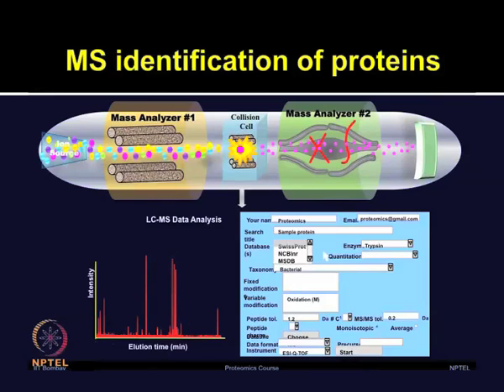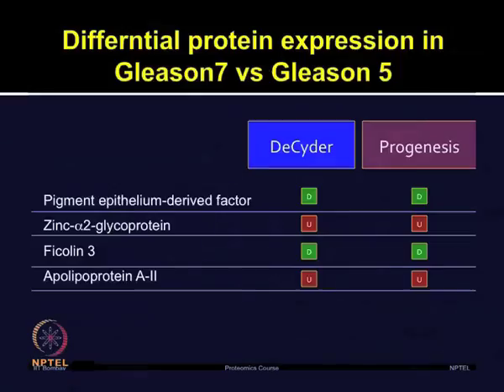After 2D-DIGE gel image analysis, the authors excised those spots and subjected them to mass spectrometry for protein identification. The proteins excised from the gels were analyzed using a Finnigan LTQ mass spectrometer, and data from these MS experiments were analyzed using the BioWorks browser with the Sequest program.